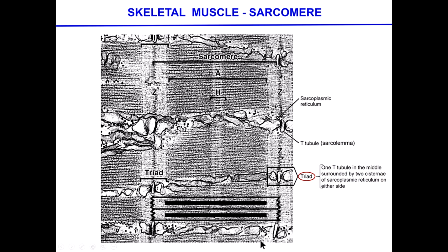You're going to get tired of looking at triads and sarcomeres. You're going to have nightmares tonight. Sarcomere was coming to the room, something like that.